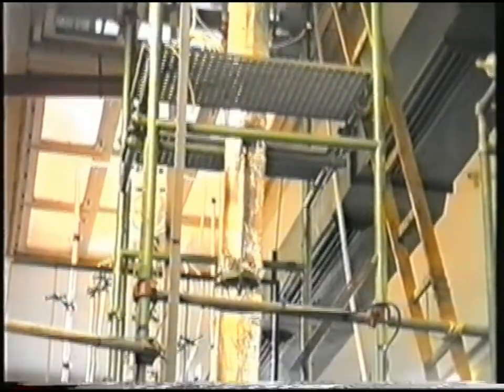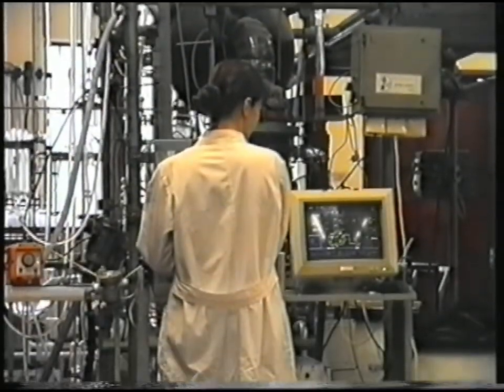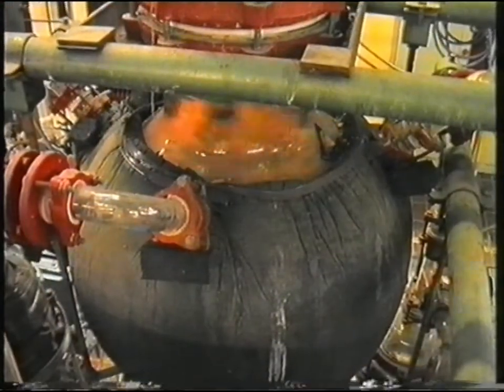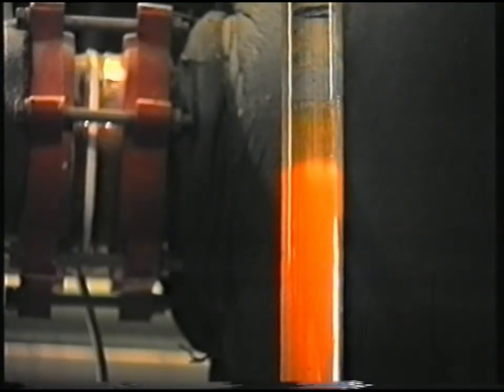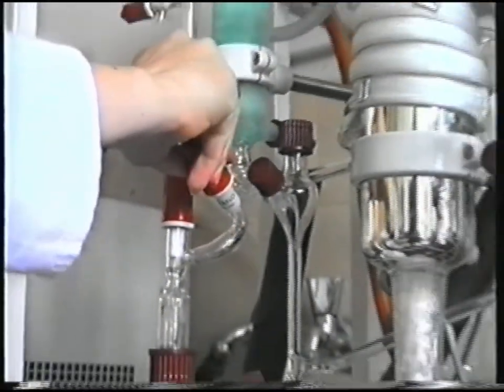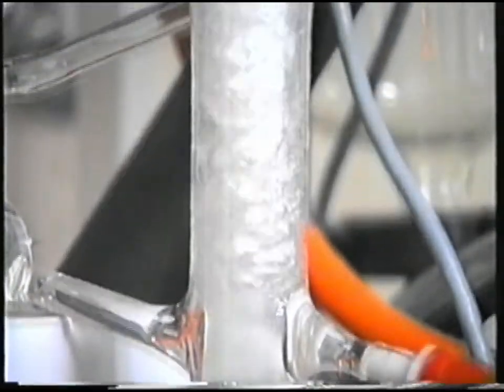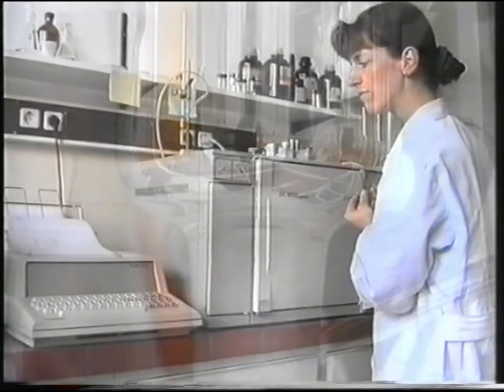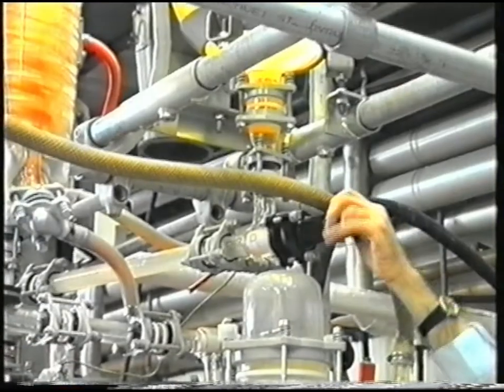Chemical processes and related products which are discovered in basic research laboratories, and which are of industrial and commercial interest, are further developed in the process laboratory. Its main aim is to study scale-up methods for various chemical reaction and separation processes, and to prepare the engineering data needed for process development of an industrial scale. The laboratory is equipped with modular units for performing chemical reactions and phase or component separations under different thermodynamic conditions and in various equipment configurations. The chemical reactors and separators used in this laboratory are of a pilot size, ranging from ten to two hundred liters, and are made of resistant materials such as glass, enamel, titanium, stainless steel and various composites.